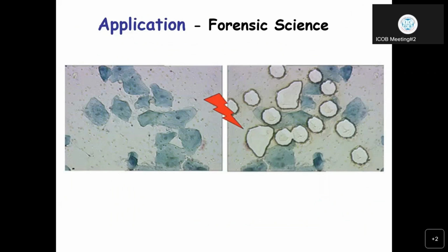For the application of forensic science, a particular challenge faced by forensic scientists is impurities of all kinds. Using laser microdissection, it is now possible to separate the required cells from impurities. These cells can be quickly identified and isolated through laser microdissection.